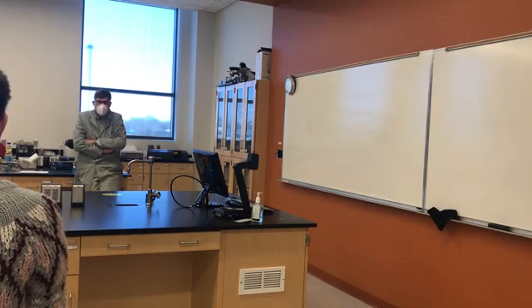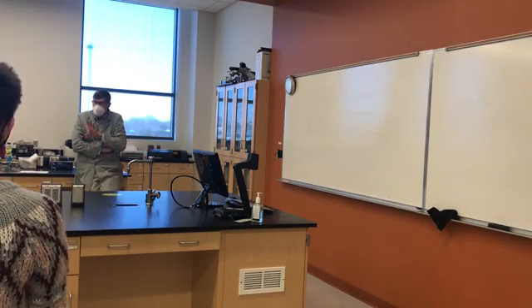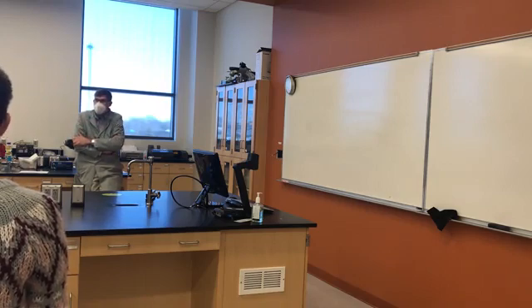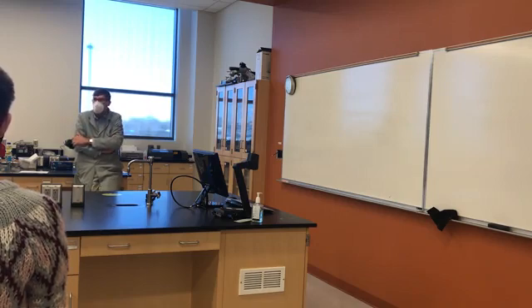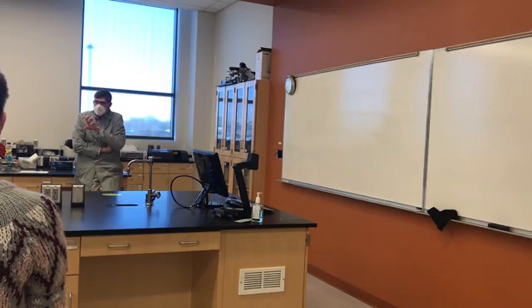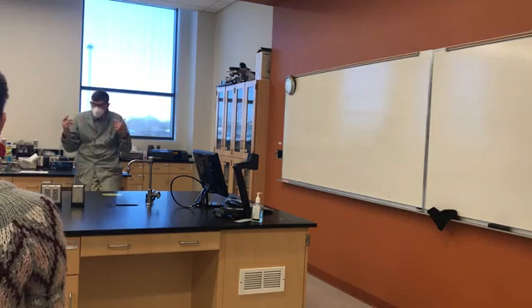So we need a way of identifying the presence of trans fatty acids, which would indicate that a product contained a partially hydrogenated oil. So we're going to look at the spectra of a soy oil, just a regular soy oil, and then we're going to look at the spectrum of a partially hydrogenated soy oil and see if we can identify differences in the spectra that would allow us to detect the presence of trans fats.